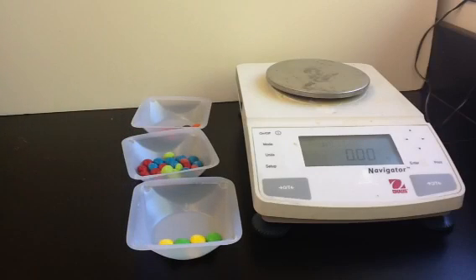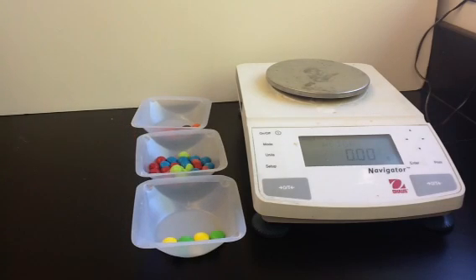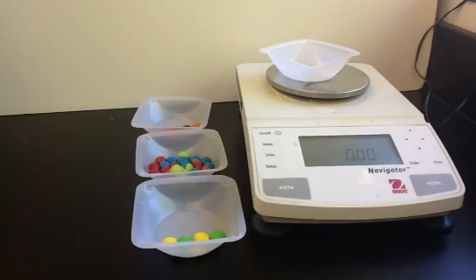This is common of most real elements. Most elements have more than one isotope, and usually the isotopes are not evenly distributed. Usually one of them is more abundant than the others. So what we're going to do next is count up how many of each type we have, and we're going to find their mass.